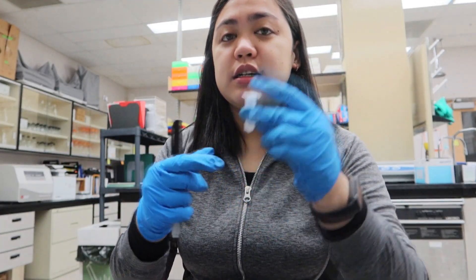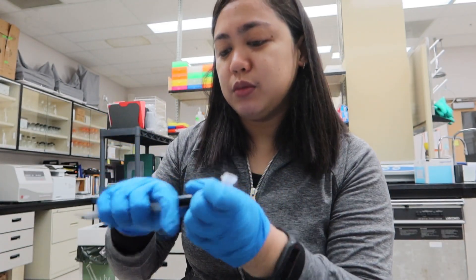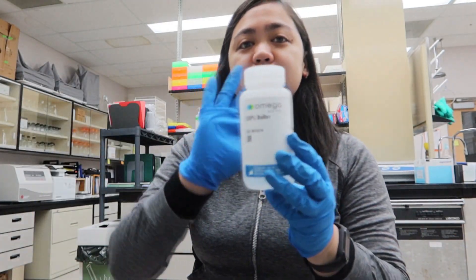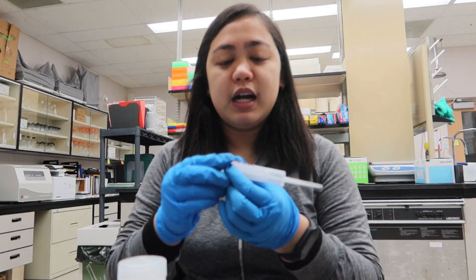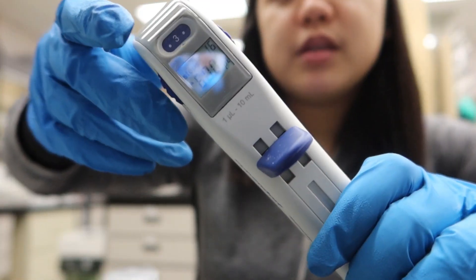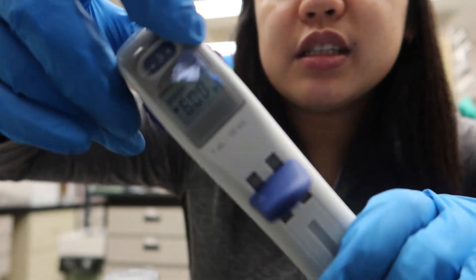Every batch, kailangan ng isang blank na tube as negative control — syempre, negative control dapat walang DNA. Tapos, kailangan ng CSPL buffer, yung parang C-tab. First time ko din gumamit ng kit. Mas mabilis, ginagamit dito ay yung tawag nila ay repeater. Since kailangan natin ng 600 µL, meaning 600 µL din ma-cater niya, 16 samples.